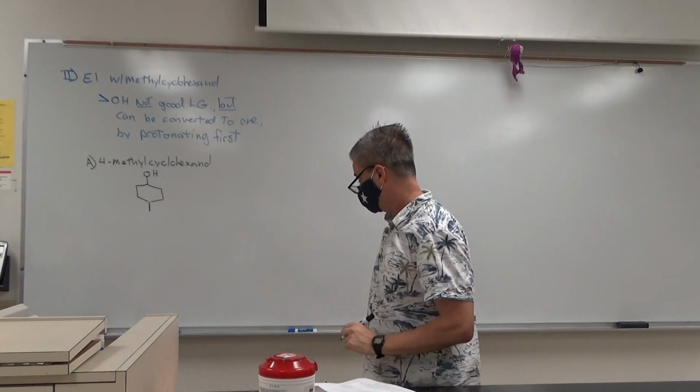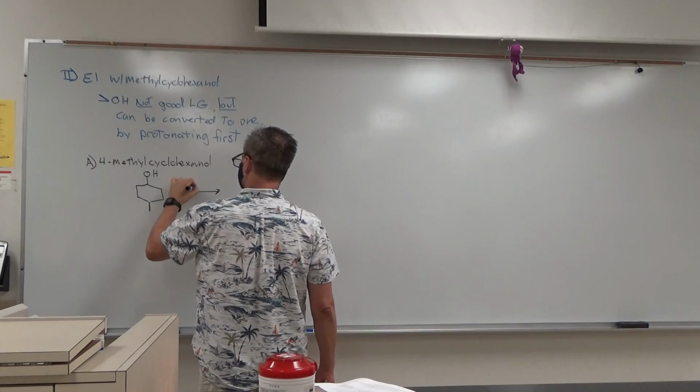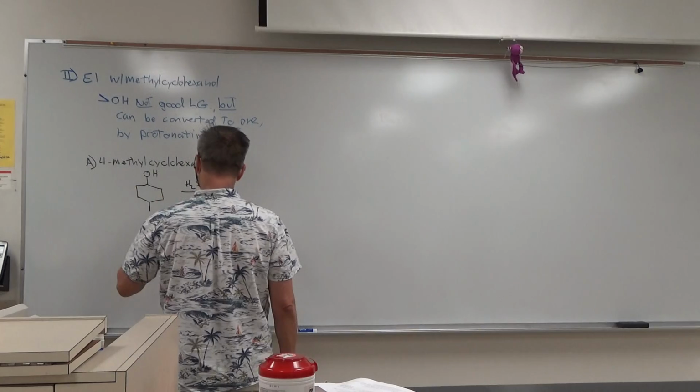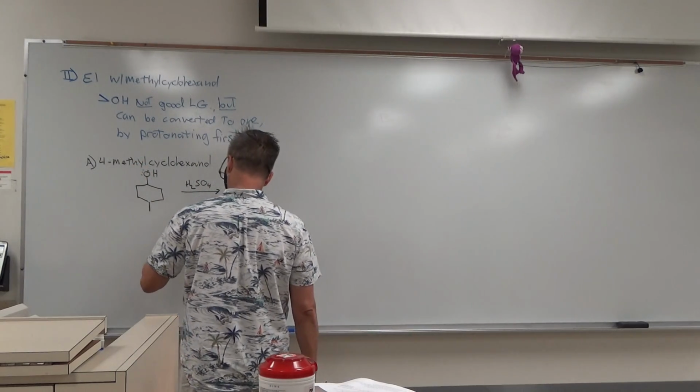That's 4-methylcyclohexanol. We're going to use sulfuric acid. I won't show you the product just yet. I'm going to show you how it gets there. Or products, I should say.